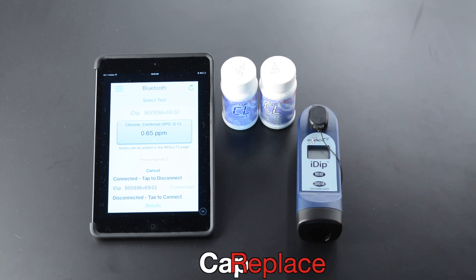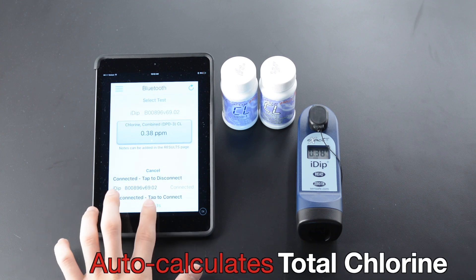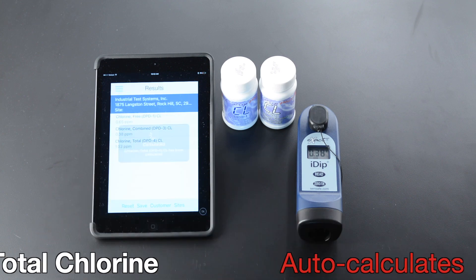Remove strip at one second. Replace cap. Read. Result. Auto Calculate. Total Chlorine.